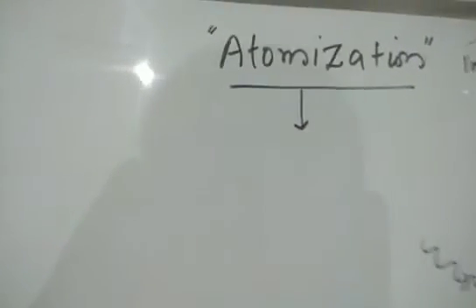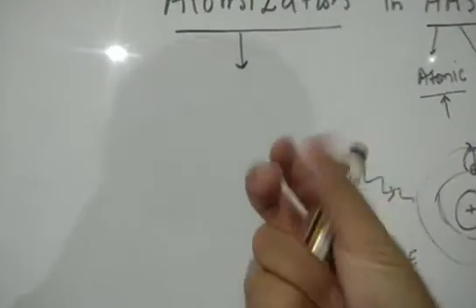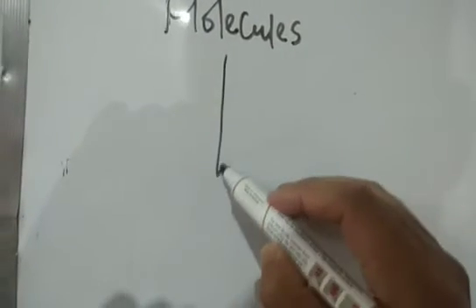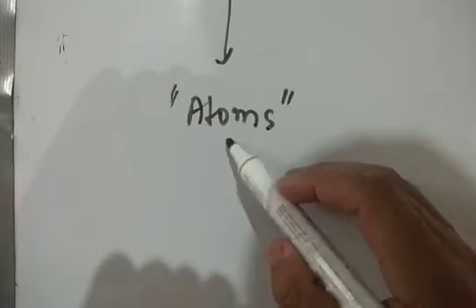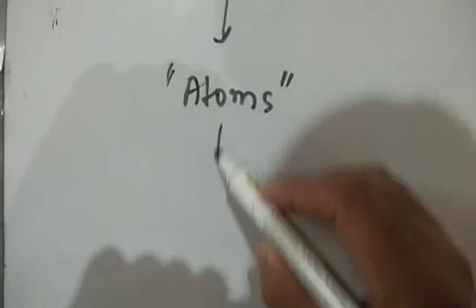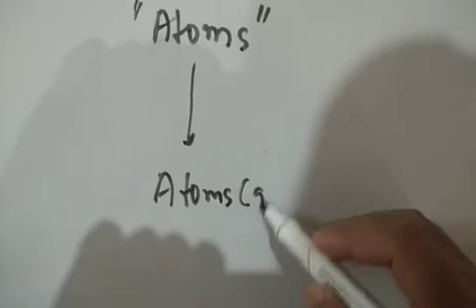As the word suggests, अब देखिए हमारे पास ये पॉसिबल नहीं है ऑलवेज कि सैंपल में फ्री एटम्स प्रेजेंट हों। सो यूजुअली सैंपल में वी हैव मॉलिक्यूल्स, ट्राइएटॉमिक, पॉलीएटॉमिक, मल्टी एटॉमिक मॉलिक्यूल्स। सो उस मॉलिक्यूल्स से एटम्स को कन्वर्ट करना, सो वी हैव टू कन्वर्ट दोज मॉलिक्यूल्स इनटू द एटम्स, ठीक। एंड देन एटम्स को जब हमें एनालाइज करना हो थ्रू द AAS, वी हैव टू कन्वर्ट दोज एटम्स इनटू द गैसियस स्टेट। सो द एटम्स शुड बी इन द gaseous state, then only they can absorb the radiations.